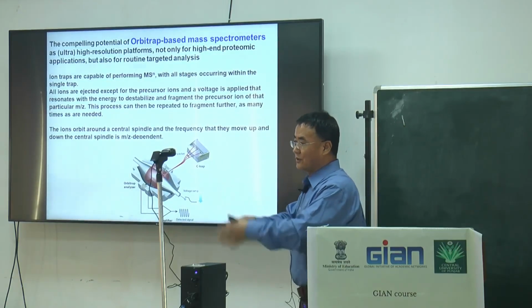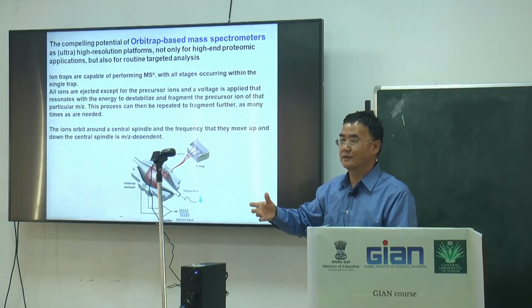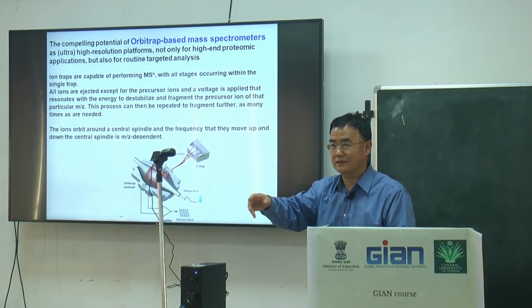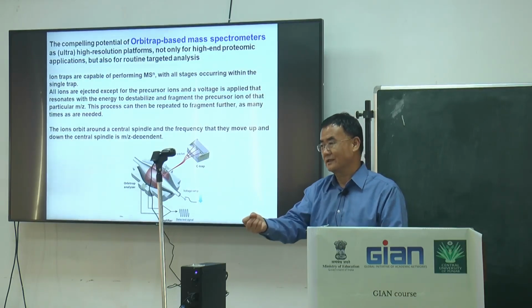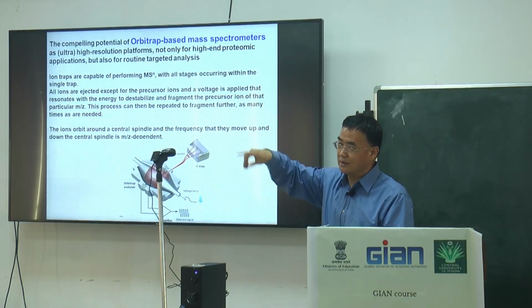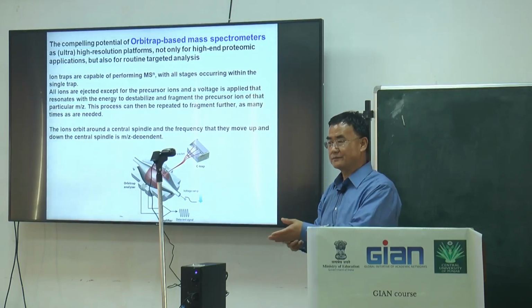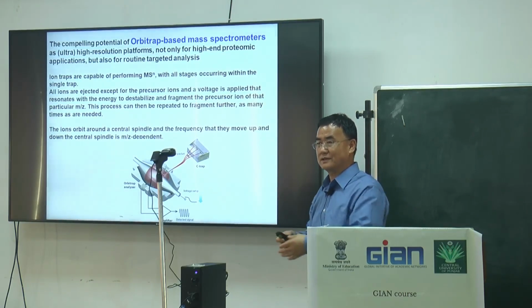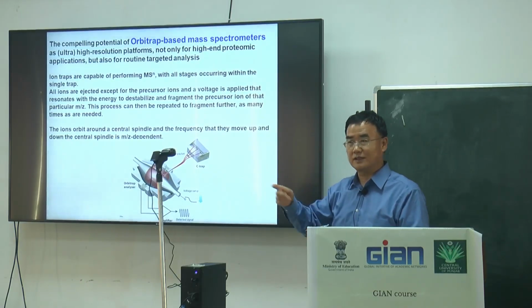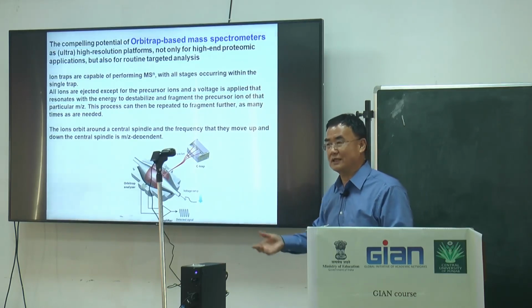You merge the protein according to this. For example, if you want to study metabolite and protein interaction, what kind of protein binds to this lipid or this compound, you can use the compound, probably link it to a resin, then pass your plant extract through. Maybe some protein binds to this, then you do protein analysis to find the truly interacting protein or metabolite.